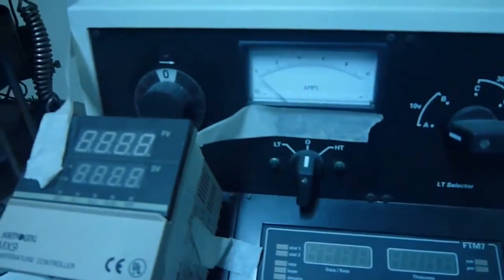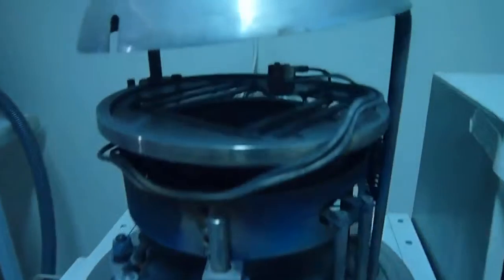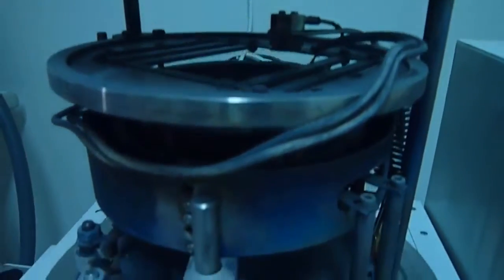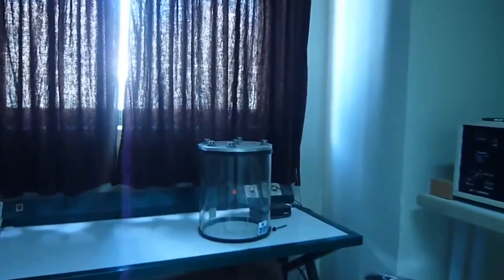PVD is used in the manufacture of items which require thin films for mechanical, optical, chemical, or electronic functions. Examples include semiconductor devices such as thin film solar panels.